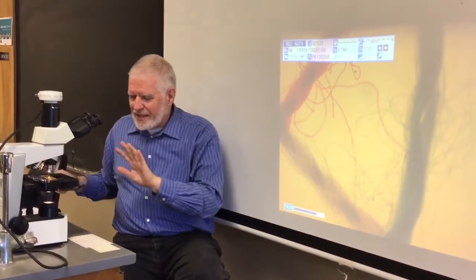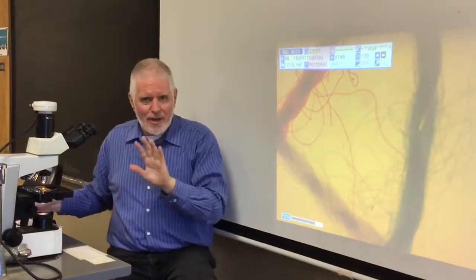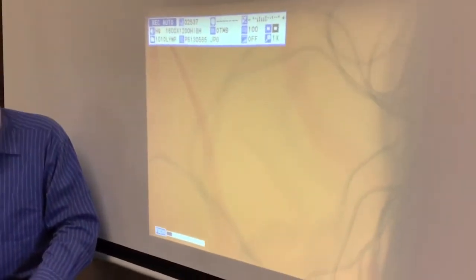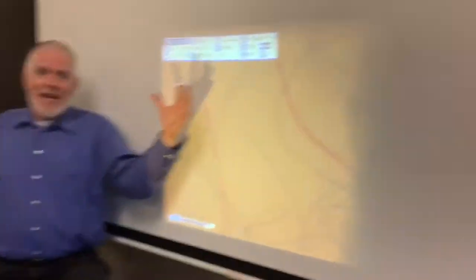So right now, this is set up for low power. We'll come back to this because question 2 is about this. But I'm going to show you some stuff. Don't come too close, because you're going to need to look at that as well. This little merry-go-round, I'm going to go up to the next power. And we're barely looking at anything. It actually is in focus, but only in part. Here's what happens. Whatever you looked at in low power, when you go another power up, you're only looking at a little bit of that because it had to make everything bigger.